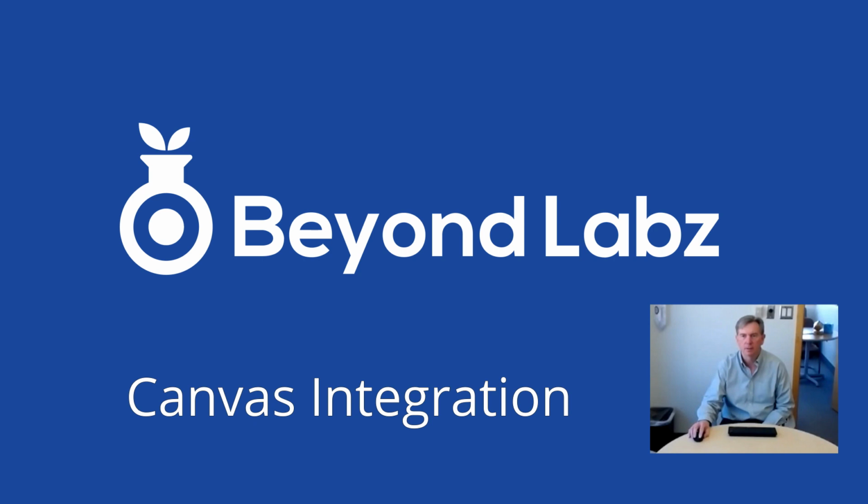So we are trying to get to the web delivered version, obviously. But what we can do, and we know it works because we have several customers doing it, is integrate the download and the assignment of the license from within Canvas. If you are having your students purchase their own codes and the school isn't doing it, then we can integrate that license purchase and assignment into the LMS as an LTI integration. So students just have to go to one location to download the product and get their license. They get the license sent to them, activate it, and they're done.